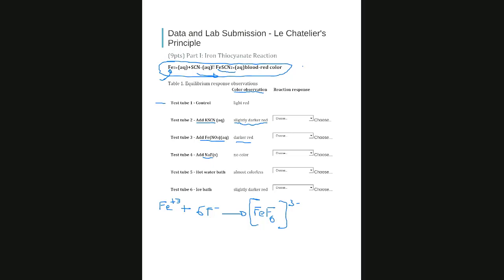They say no color. What does no color mean? The left side, the reactant side, is no color. We said that iron has almost no color, a little yellow, and the other reactant has no color. Only the product side is colored. And if we add fluoride and it says no color, you know where it shifts to.